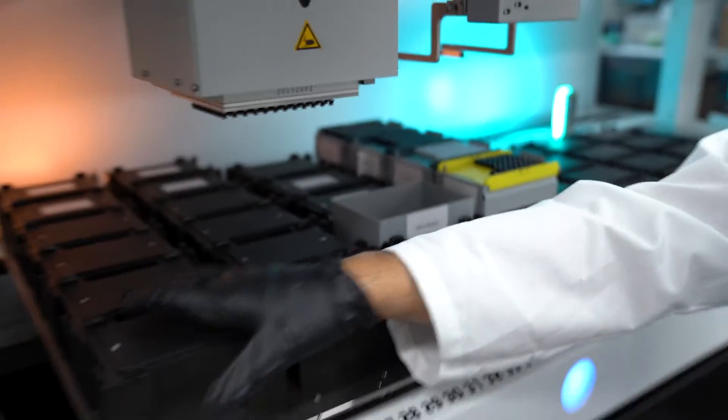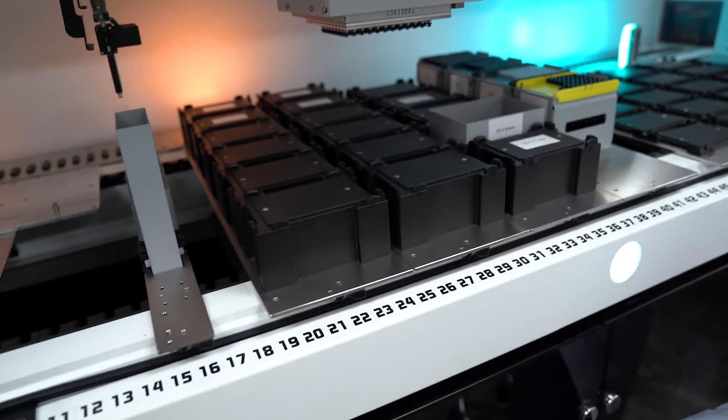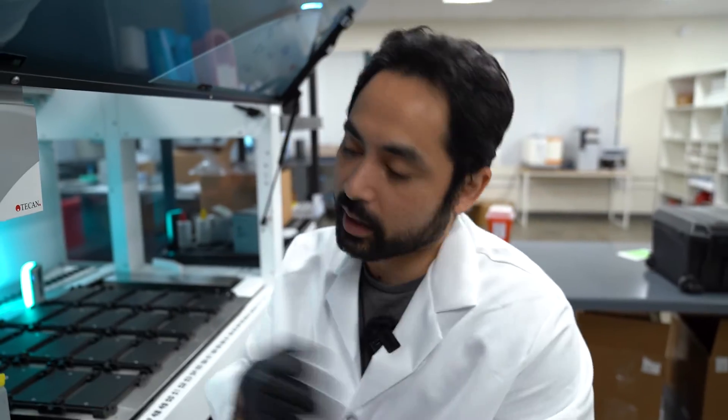Or a deep well plate would be a form of labware. So just things that you could put on and off are labware and carriers. Well, obviously they carry the labware, hence the name carrier. So let me show you where all of this is represented within the software and that's called a work table.